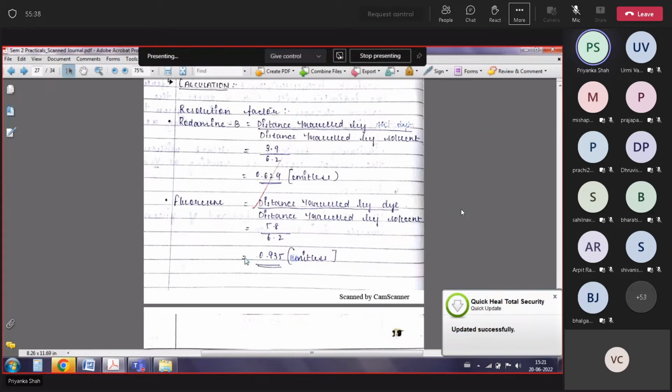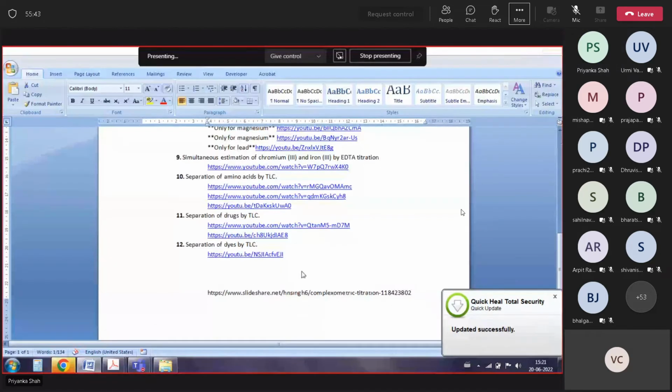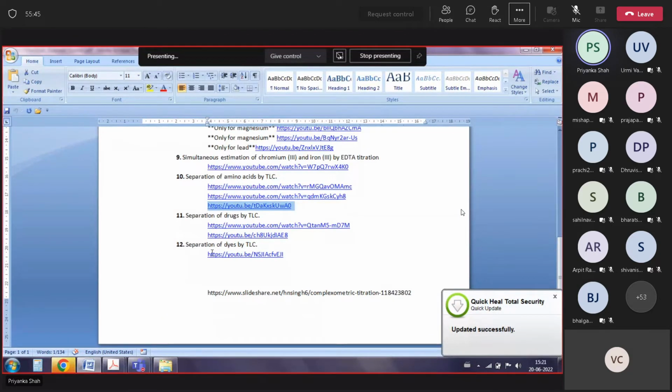I have one video so that you will have a clear idea about how you can separate dyes on a TLC plate. Just a minute.